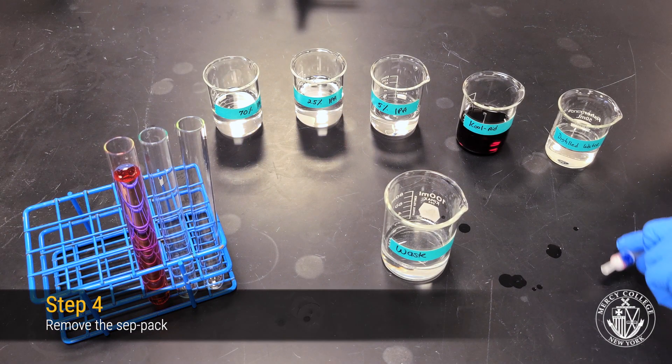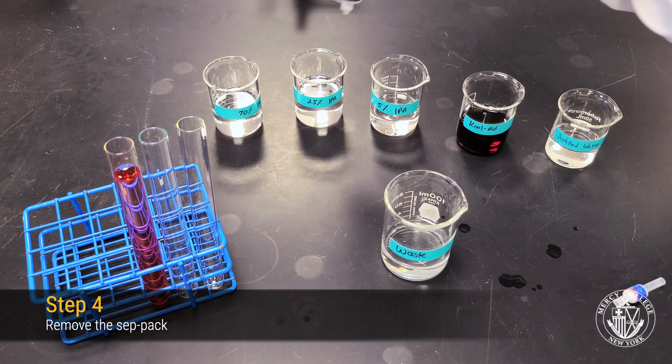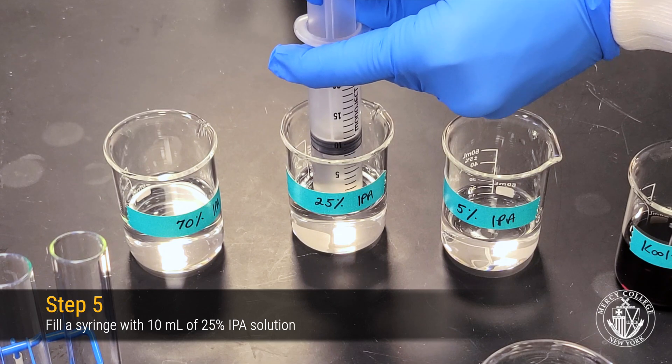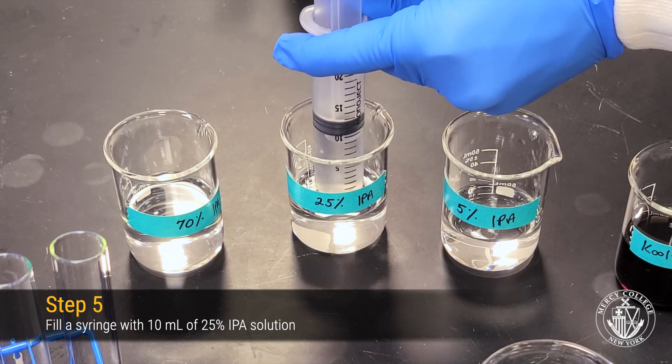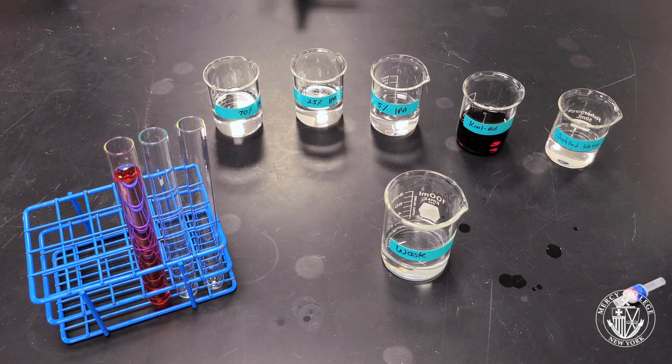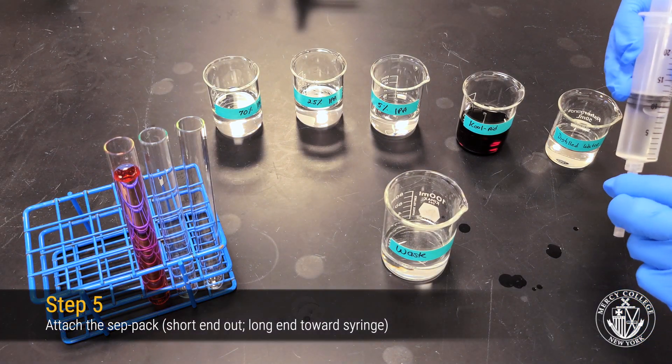Now remove the CEPPAC cartridge from your syringe and refill your syringe using 10 mL of 25% isopropyl alcohol solution. After filling your syringe, reattach the CEPPAC cartridge making sure that the long end is facing toward the syringe.